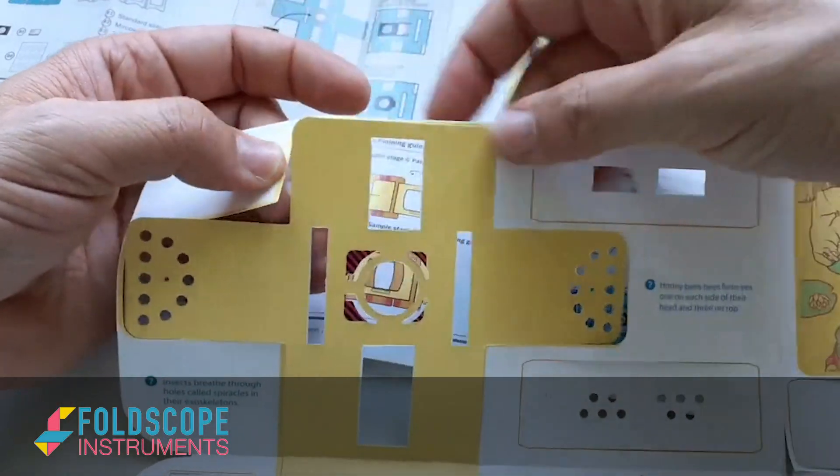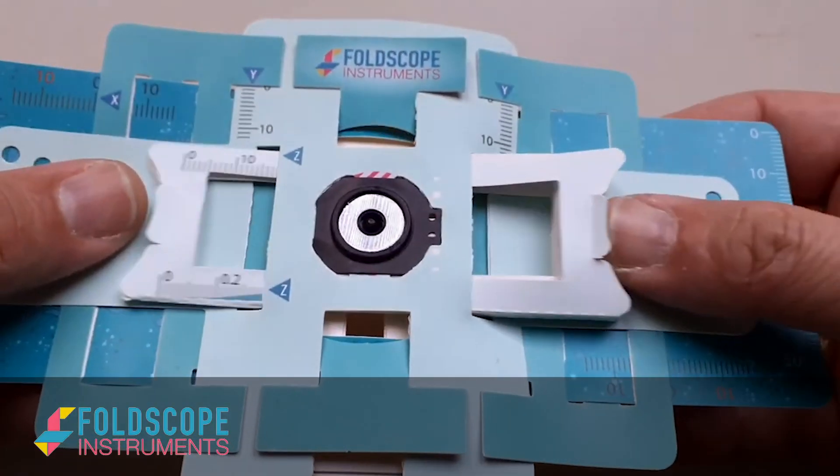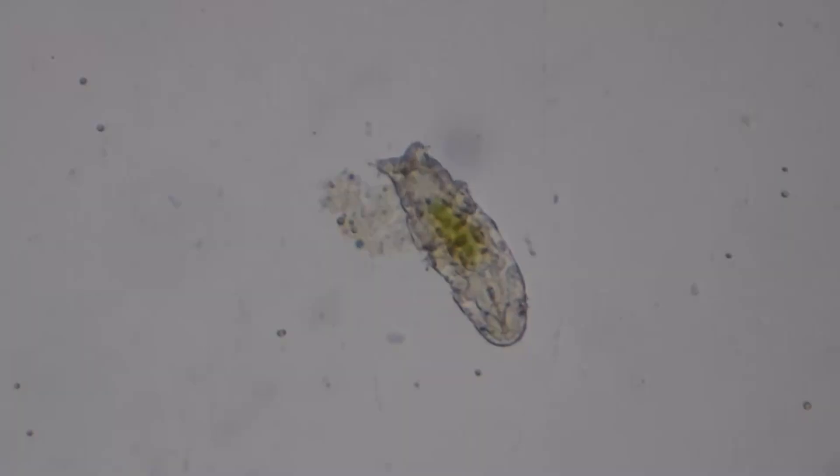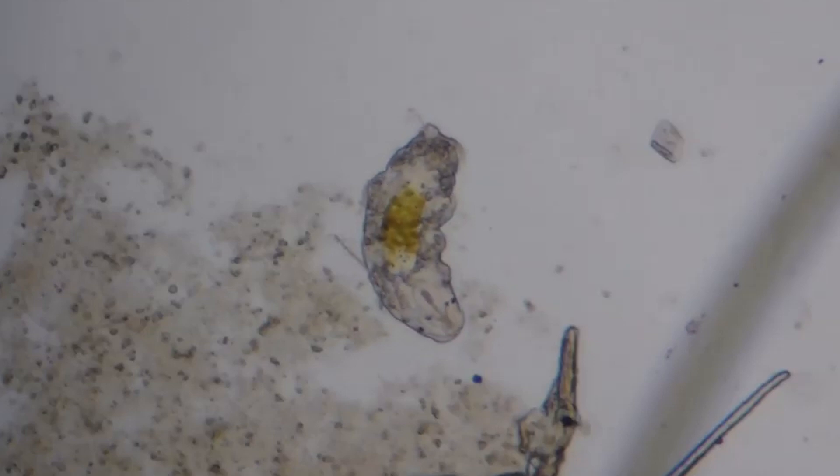Foldscope is the portable, ultra-affordable paper microscope. With magnification of 140 times, your students can view the many wonders of the microscopic world.